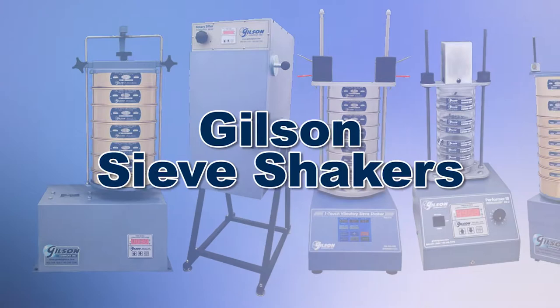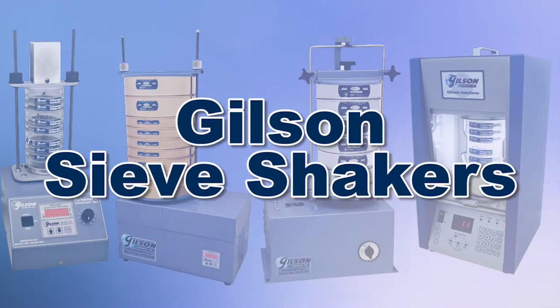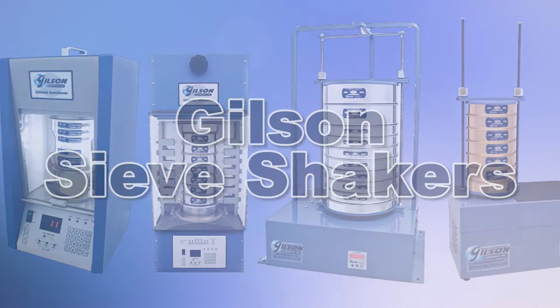With Gilson's complete family of sieve shakers offering a wide range of performance, features, and capacities, Gilson has the right equipment for your fast, accurate, and reliable particle sizing analysis.